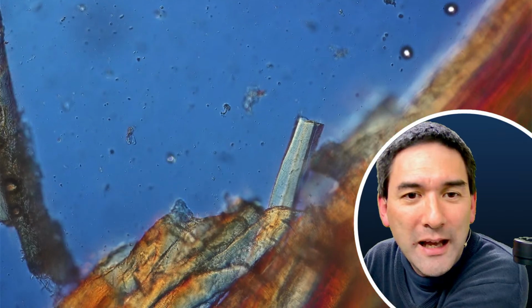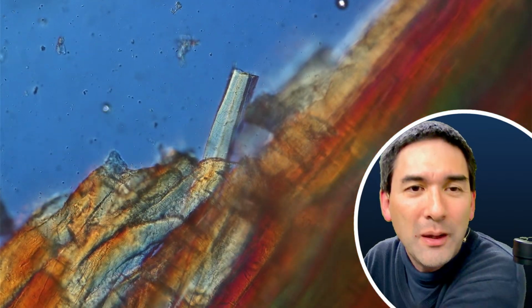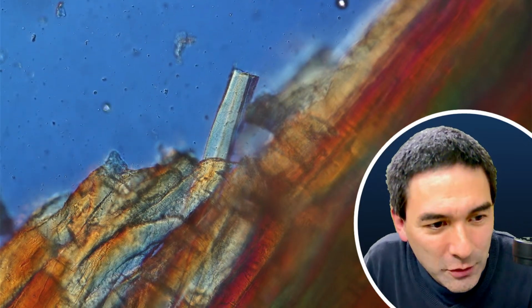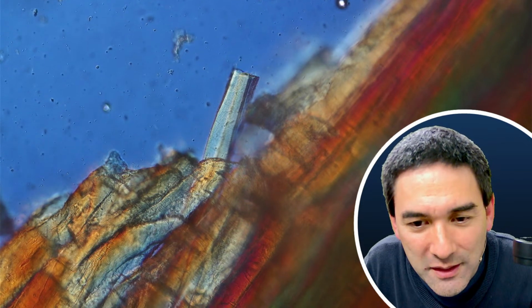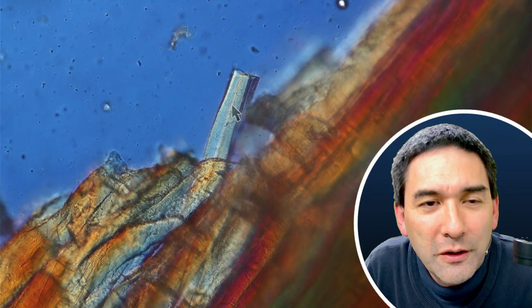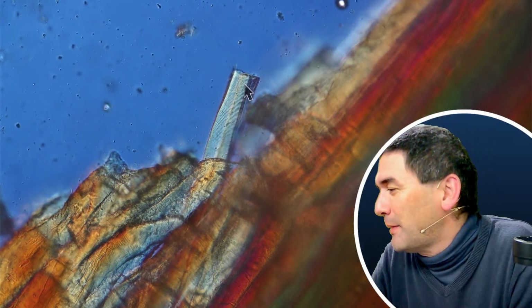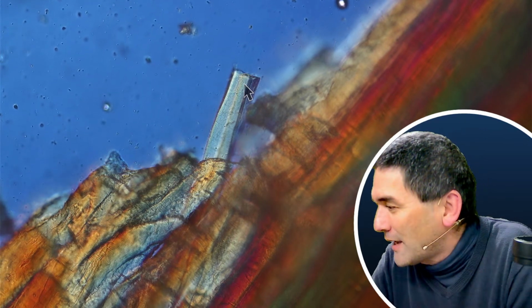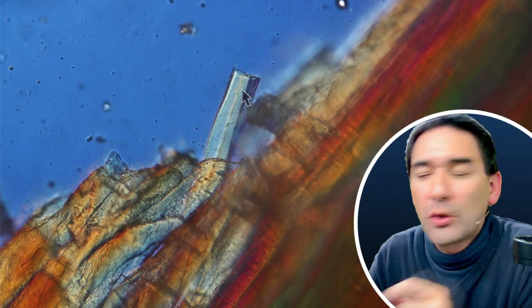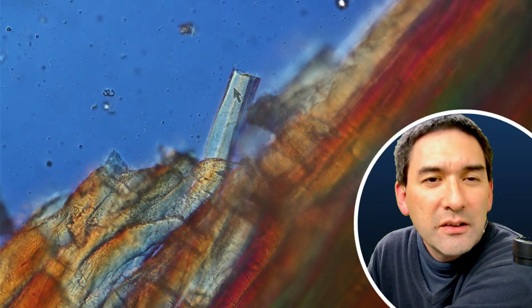Okay, I'm going to explain to you now what I'm seeing here and why I'm so excited. So where is the arrow? It actually worked. I cannot believe this. Here is the arrow. Look at this cell over here. And I hope that you're able to see this on YouTube. I'm using now my 20 times objective. I cannot go higher because it's so thick that I'm actually going to bump into the microscope slide. But are you able to see the striations? It looks like striped.